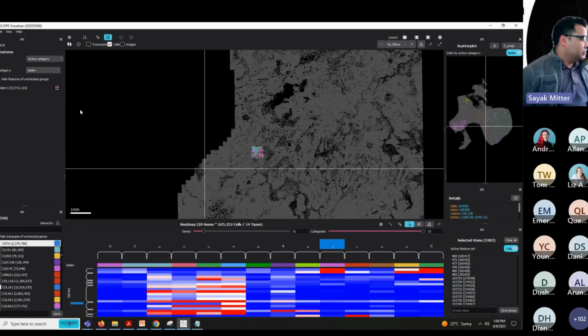Your next question, I'm anticipating, is how do I then look for these proteins? There are two ways you can do this. If you want to look at the protein expression, there are plenty of GFP primary antibodies available, so you can definitely take advantage of our co-detection. Just like the cell boundary stains I showed here, you can co-detect proteins.